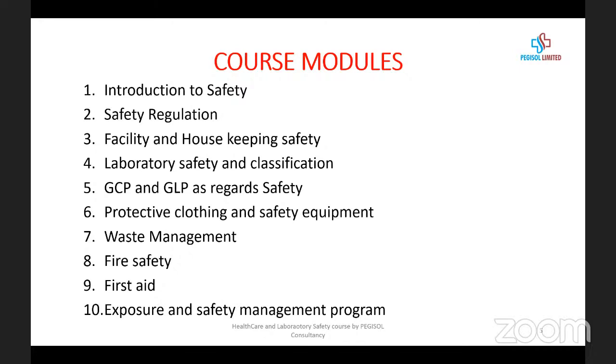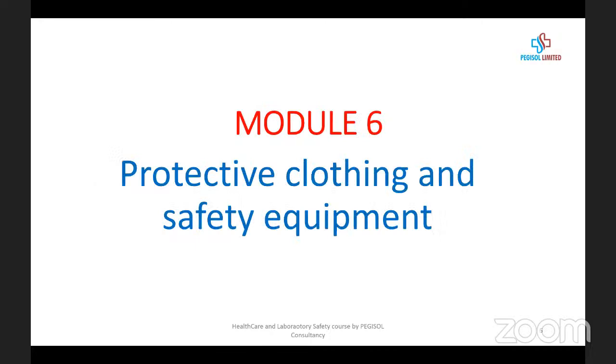In the previous section, we looked at waste management and fire safety. So tonight I will be doing protective clothing and safety equipment, first aid and exposure, and safety management program. So I'll be doing module 6, module 9, and module 10. First is protective clothing and safety equipment.